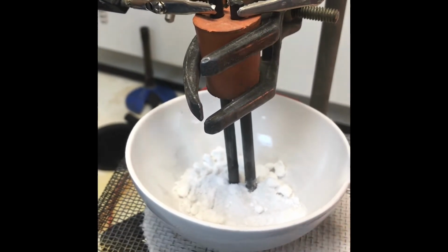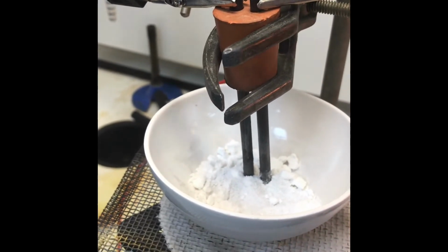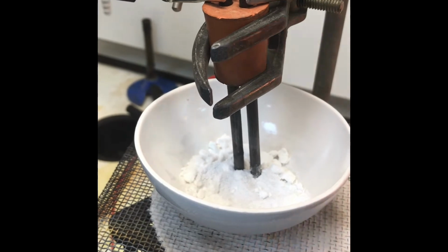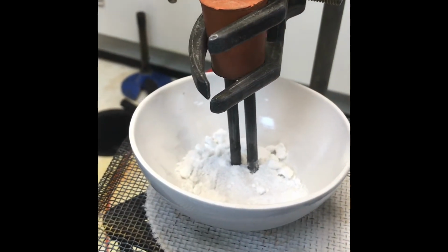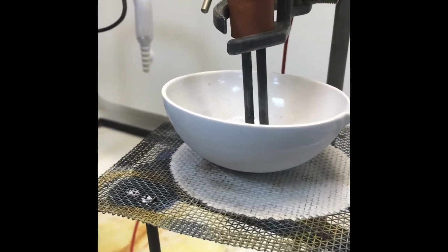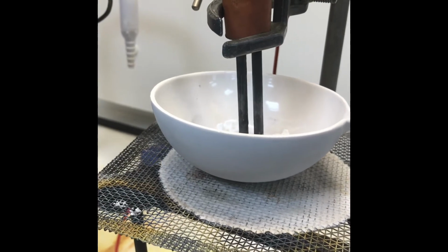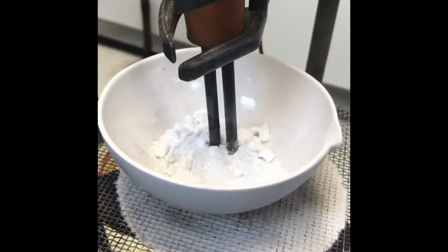Ways in which we can free up the ions for giant ionic structures: we can melt them and make them molten, or we can dissolve them and form a solution. In this case, I'm just going to use a Bunsen burner to start to heat our sample, and as it melts the ions are then able to move.